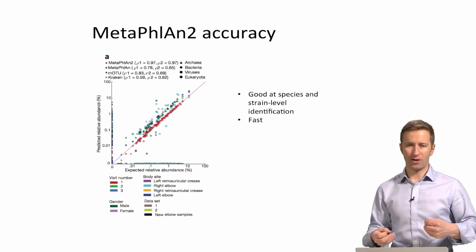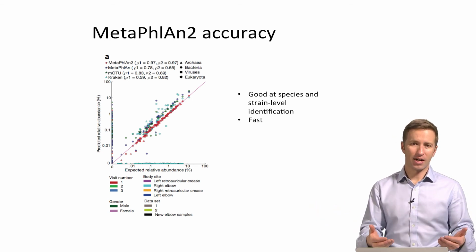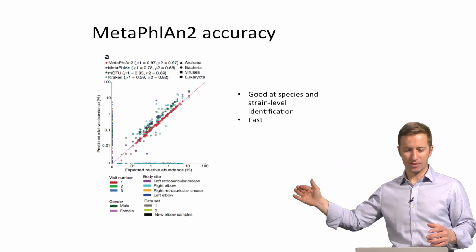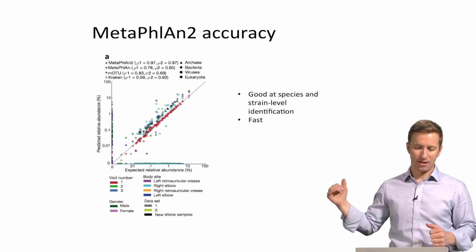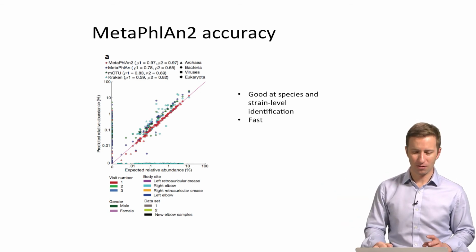And so you can actually find metagenomic OTUs, or MOTUs, from the analysis. So it could be that using some combination of the MetaPhlAn 2 estimates of the known bugs and then the metagenomic OTUs for the rest of the sequences might give you the best features.